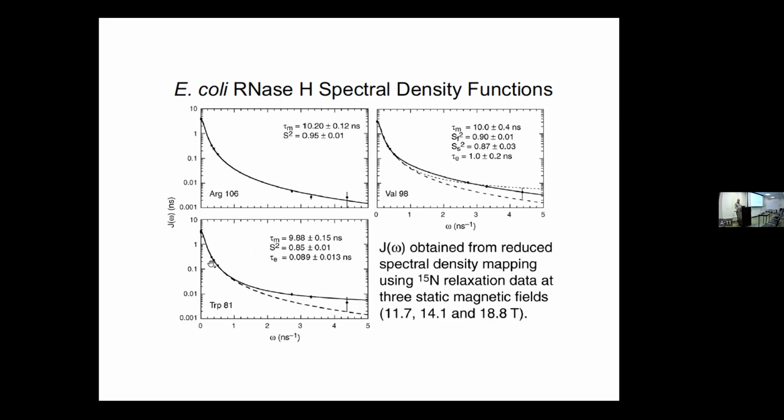Our first points coming from J(omega_n) are already roughly an order of magnitude smaller than J0. And all of these spectral density curves have this profile that looks like this. They have this rollover where you get to the 1 over omega squared regime. So you really want to sample the rollover, and the rollover has already happened for these data.